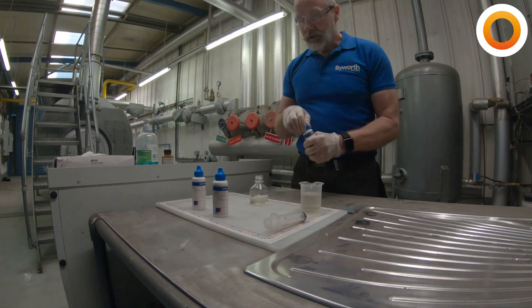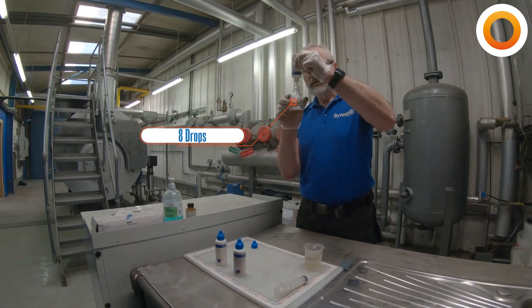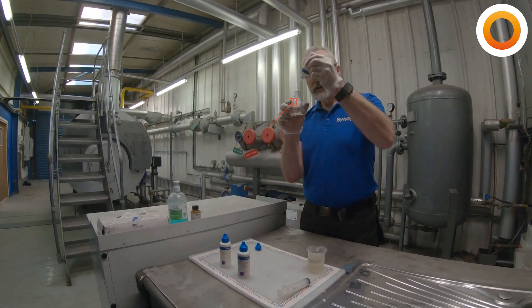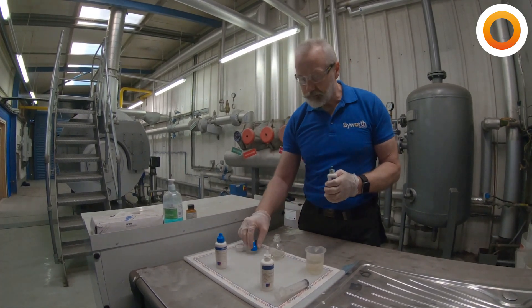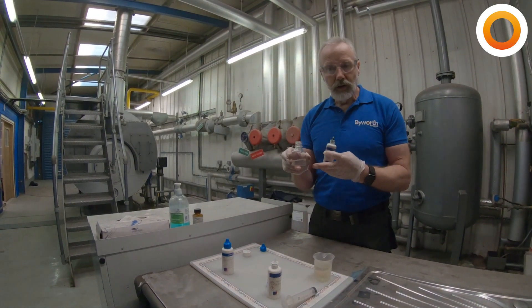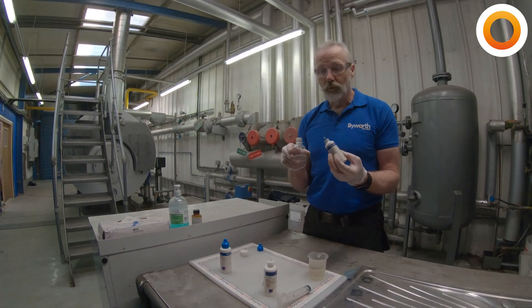Then we take hardness one — eight drops of this. And then the activator, hardness two. When we put this in, what we're expecting to happen is: if it stays blue, then we have soft water from our softener. If it turns pink, we've got hardness in the water.